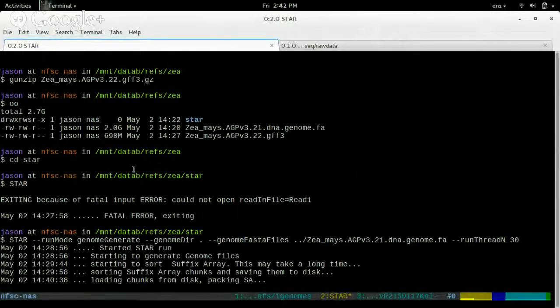Once you do that, you'll be in a Linux environment. It's like a little window into that system, and you can download stuff to that machine and run things on that machine. So none of this is running on my computer, for instance. I have a little dinky laptop that can barely handle this Hangout, and so it would not be able to do this alignment at all. That's how I'm doing it, because I'm remotely logged in. Does that make sense? Yes, yes. Okay. What other questions?